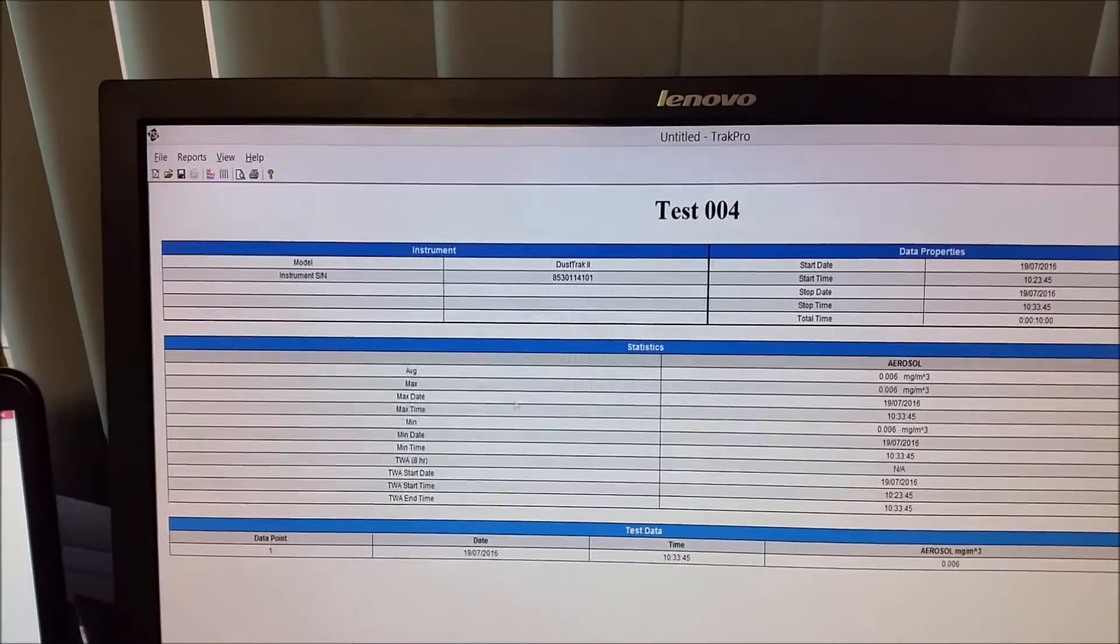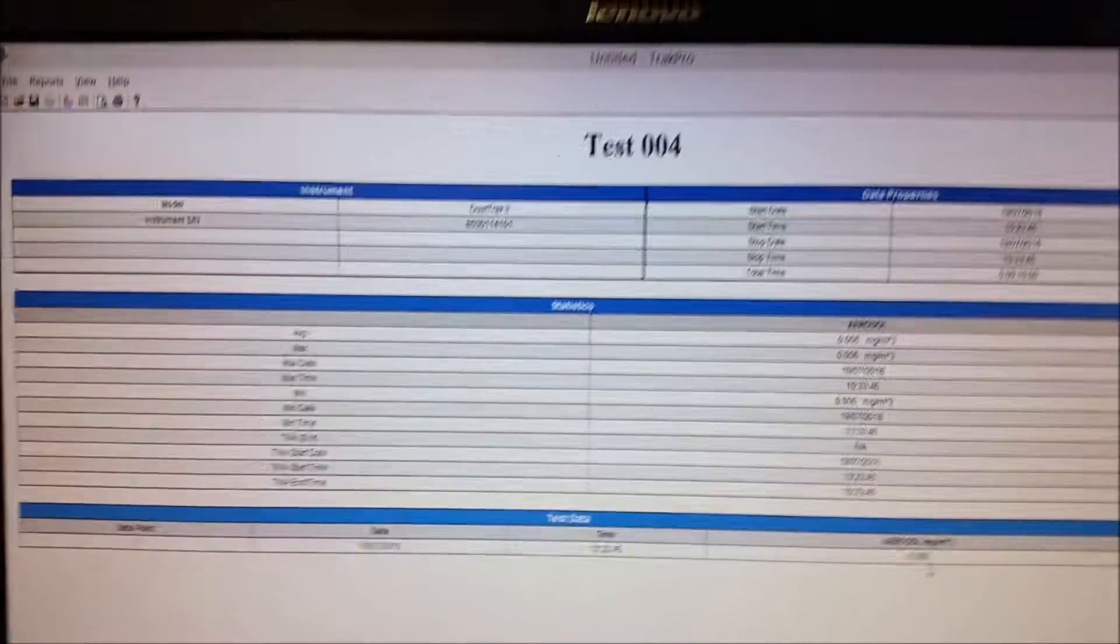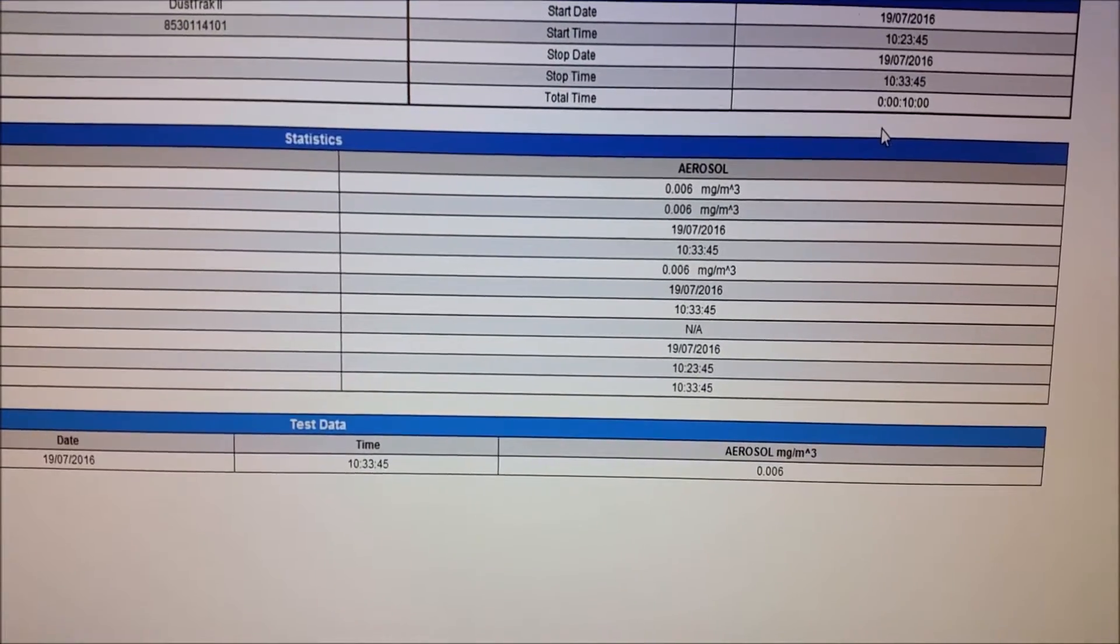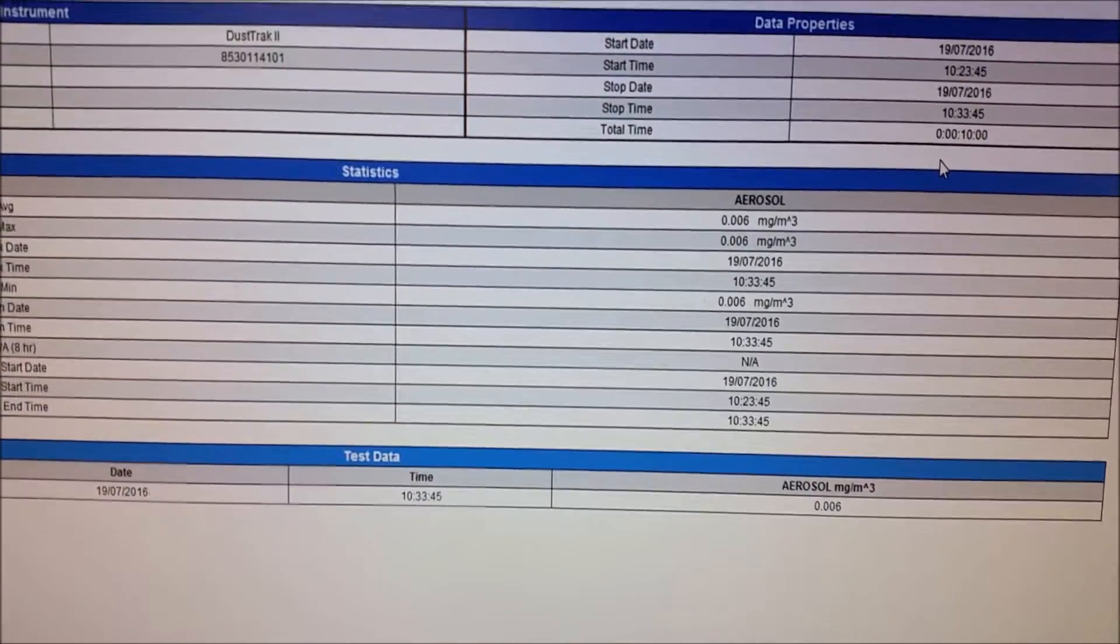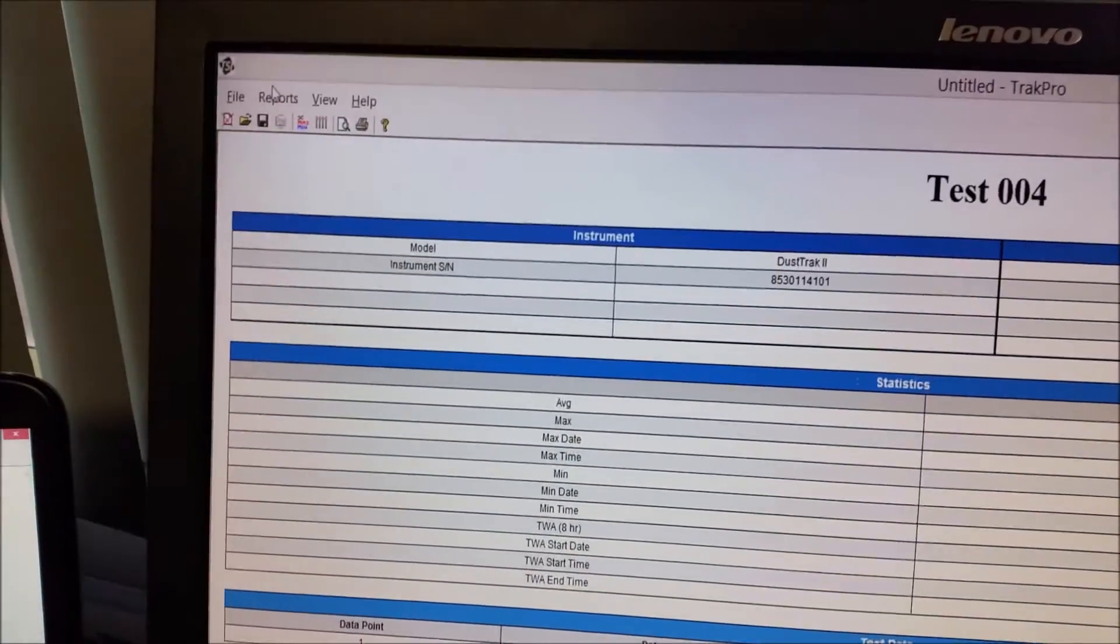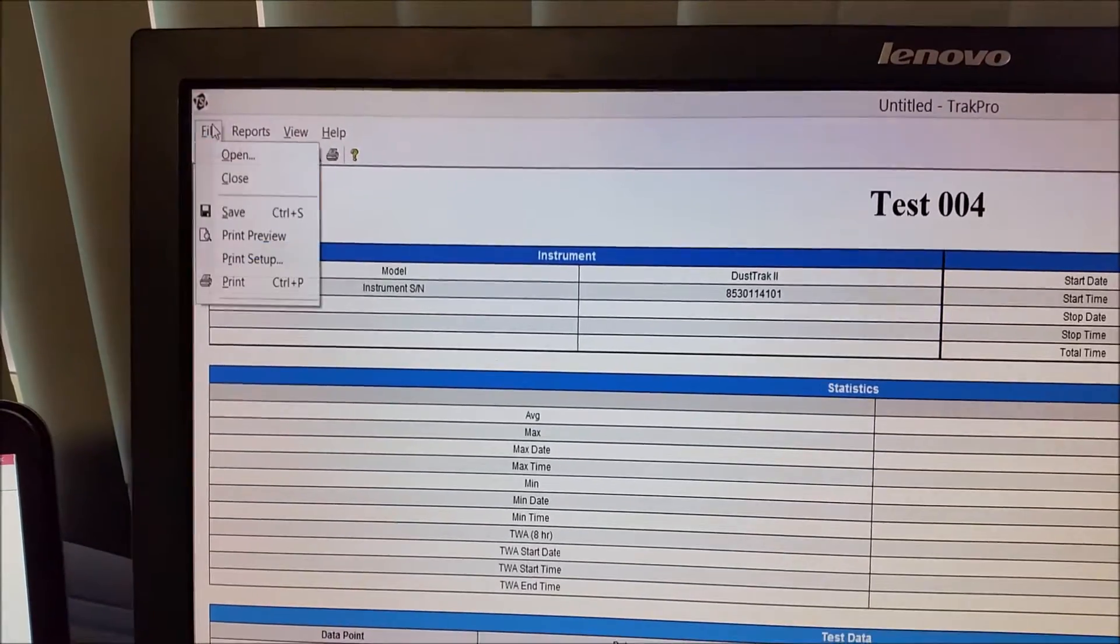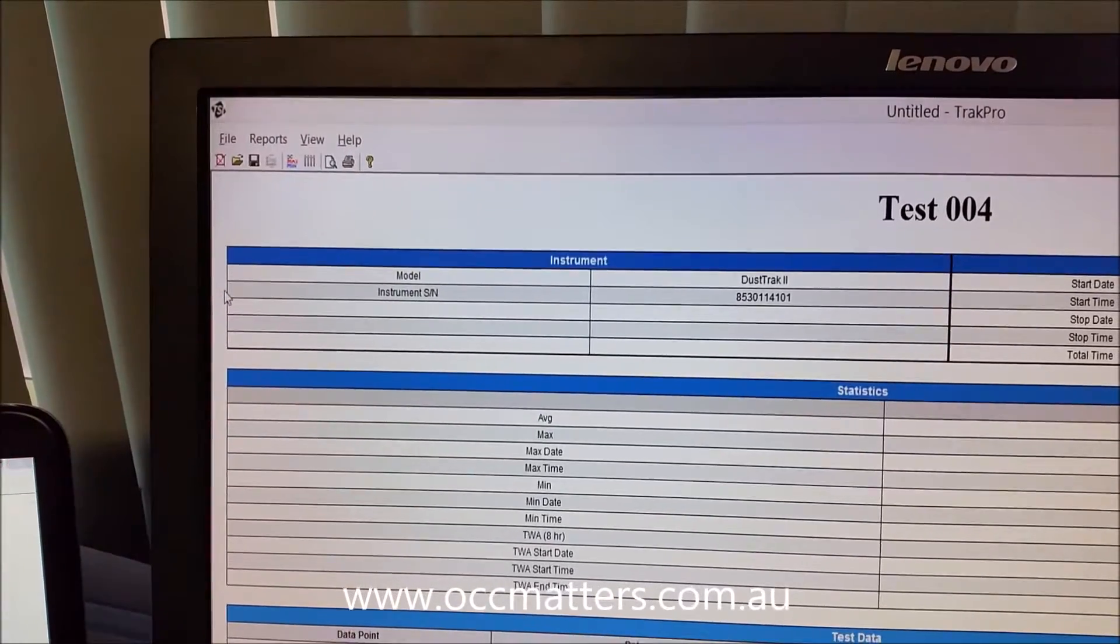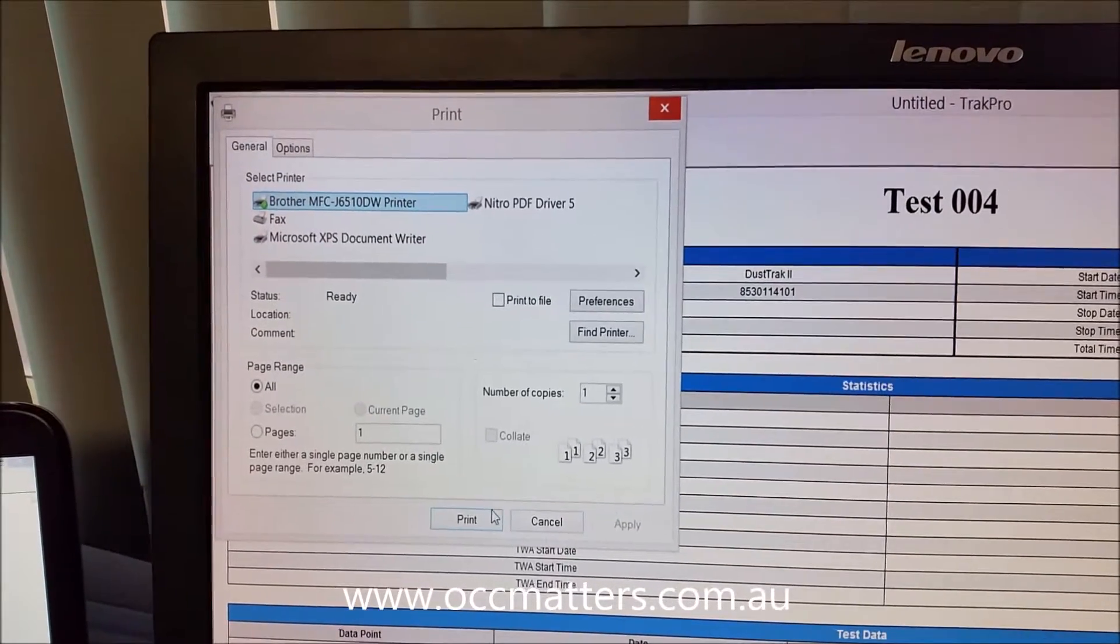And this will give you the minimum maximum plus your concentration. It will give you the stop start time. So, if we go to print that out, go into the print icon, and then we just print.